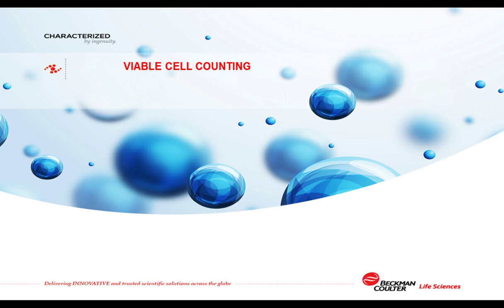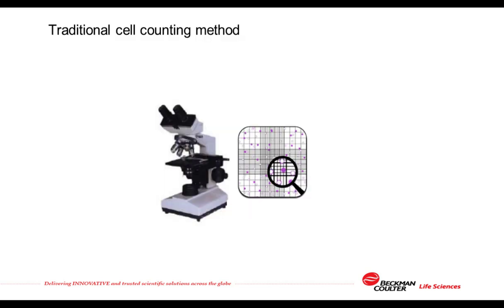So let's move on to take a look at how viable cell counting can be automated. In their 2003 guidance on the implementation of their 21 CFR Part 11 data integrity rule, the FDA used the acronym ALCOA, where they define good data integrity practice as creating records that are attributable to the technician carrying out the testing, are legible, are created contemporaneously, original, and accurate.